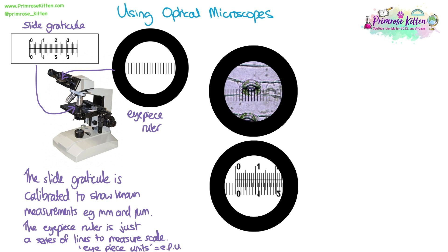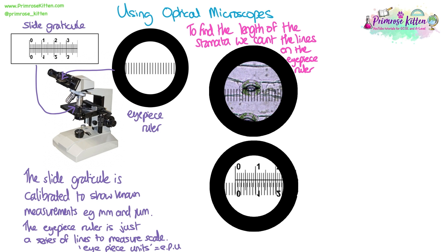Let's look at an example of how to use the eyepiece ruler and slide graticule to measure a stomata. Using the eyepiece ruler aligned over the stomata, I count the number of eyepiece units that make up the length: one, two, three, four, five, six, seven — so it's seven eyepiece units.